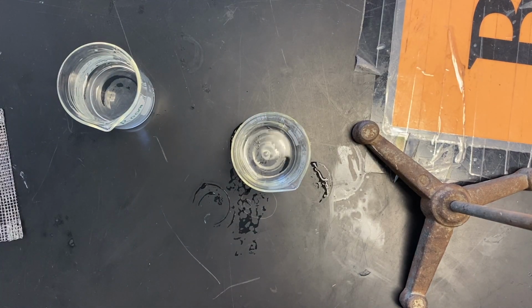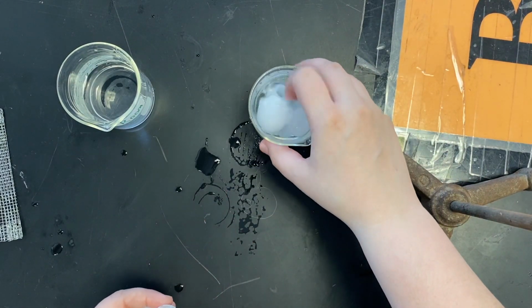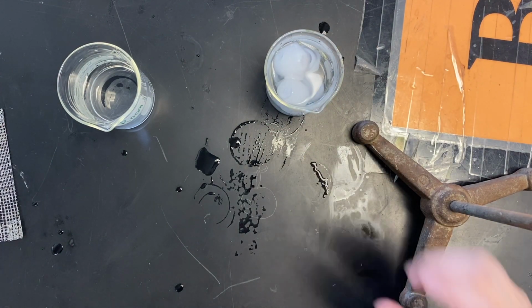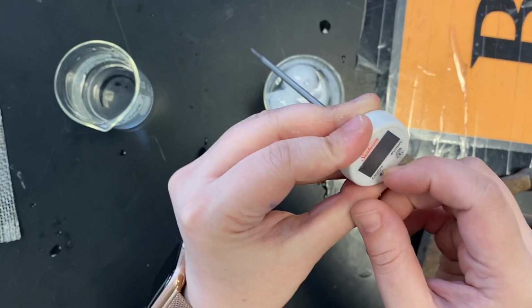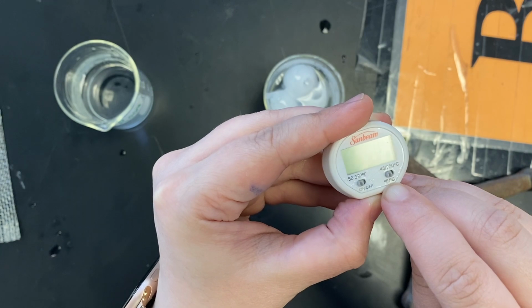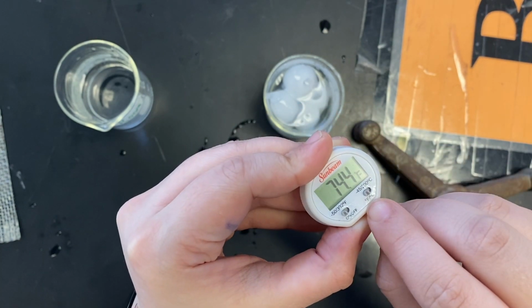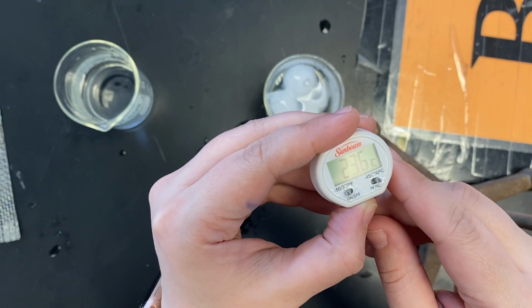So go to the teacher's desk and grab some ice. When you come back with your ice, you'll let that cool down for a bit too. So make sure it is on, you turn it on. And then that we are in the Celsius unit, okay? So if it's switched to F, just quickly switch it to C, okay?